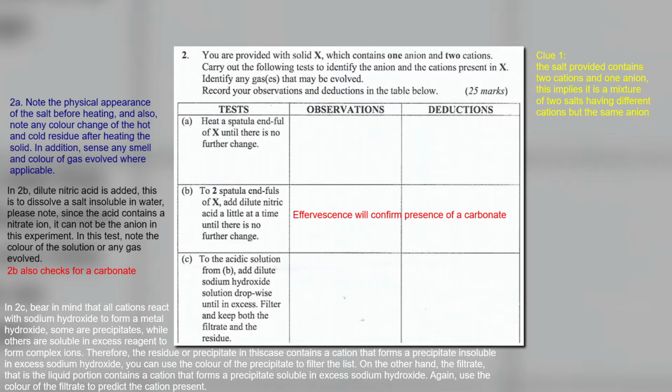2a. Note the physical appearance of the salt before heating, and also note any color change of the hot and cold residue after heating the solid. In addition, note any smell and color of gas evolved where applicable.